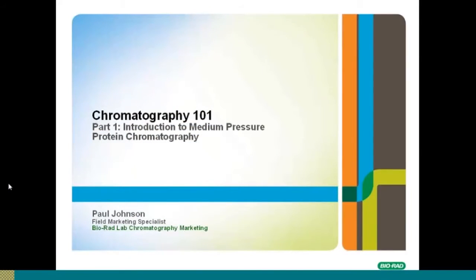I'm here today to tell you a little bit about the basics of chromatography and also tell you about our new NGC product and how it may help your research. Welcome to Chromatography 101. This is part 1, an introduction to medium pressure protein chromatography.